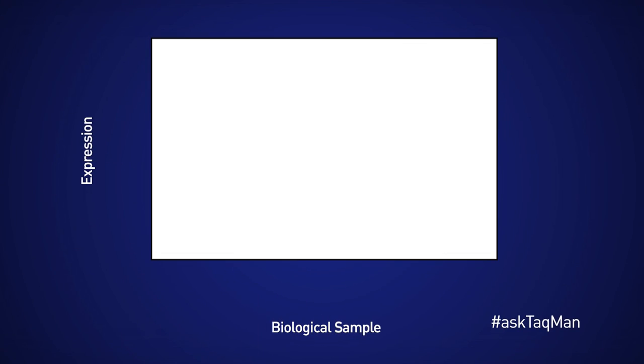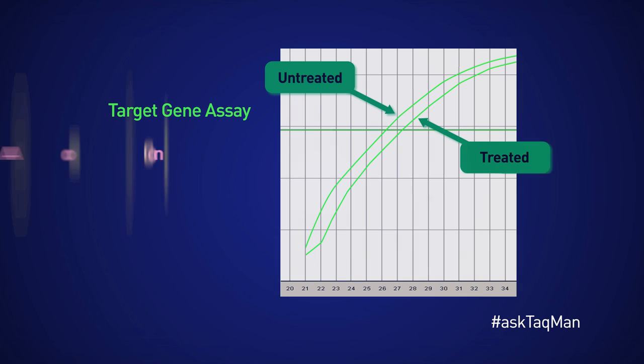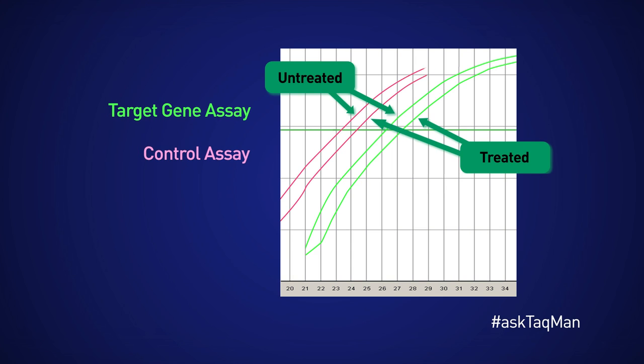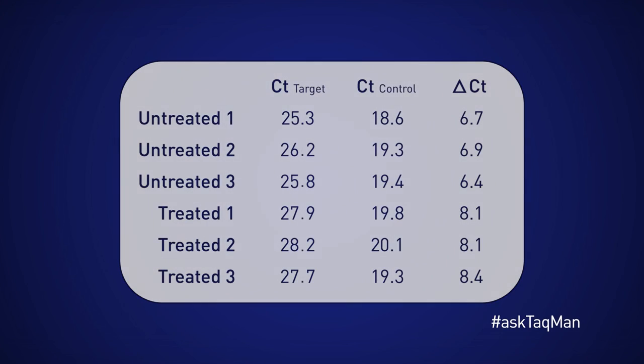A good normalizer gene is one whose expression is stable across my various sample types, assuming equal starting amounts. Thanks to the data I collect from the second gene assay, I can effectively monitor input amounts of cDNA, even when they differ from sample to sample. Then, at the end of the run, I can use CT data from the normalizer gene to correct final expression values for differing input amounts of cDNA. I can thereby avoid having to always add equal amounts of template when running my experiments.